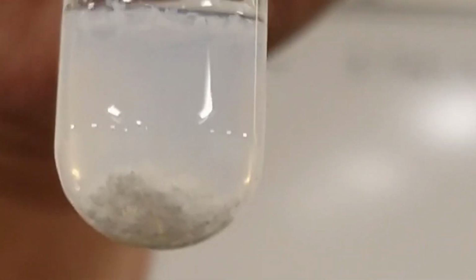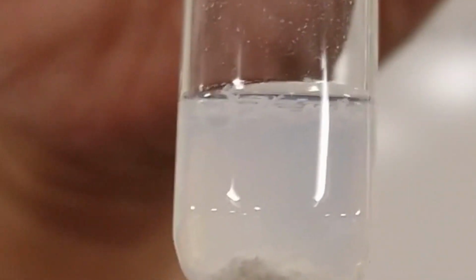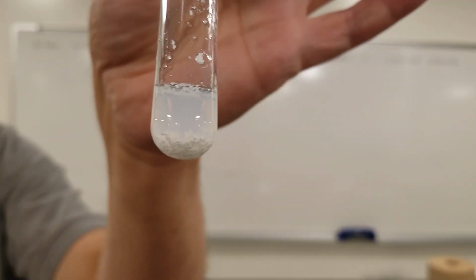There's our reaction, and you see that white solid at the bottom? That is the silver chloride. It is called a precipitate. So when you mix 2 clear solutions and suddenly it gets all cloudy, you get solid material, the solid is referred to as a precipitate.